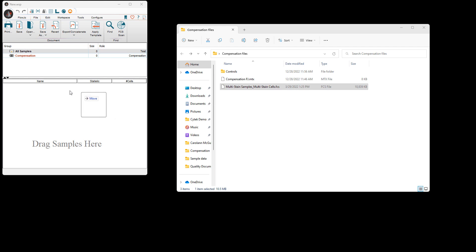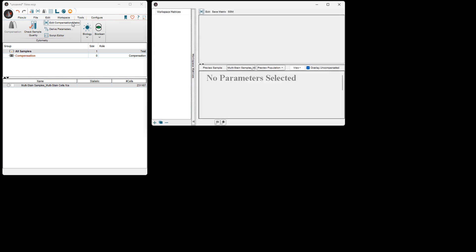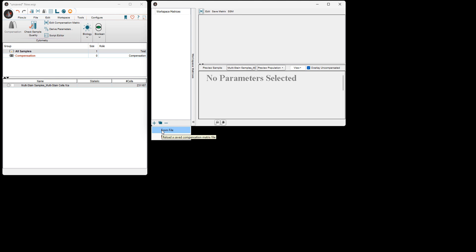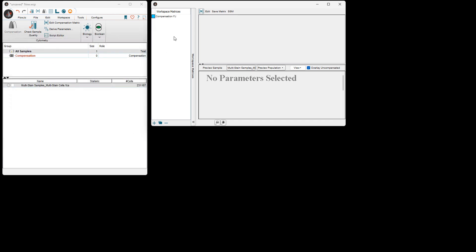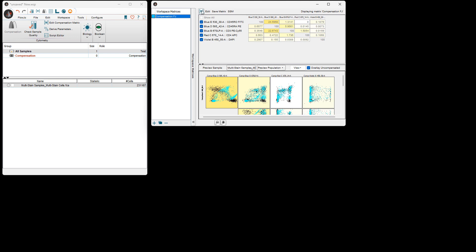To apply the compensation matrix to samples in FlowJo, you will load a file into FlowJo, select Edit Compensation Matrix in the Tools, then load the compensation matrix file that you had previously saved. Once you have imported the matrix, you will drag the matrix to your sample or sample groups. Files can then be analyzed. Parameters that have been compensated will appear with the Comp prefix from the list of available parameters.